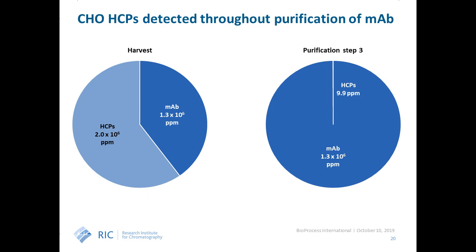And in both cases, the therapeutic is quantified at 1.3 milligram per milligram, where it theoretically should be 1 milligram, of course. And this gives you already a very nice idea on the accuracy of this semi-quantitation strategy, which is generally expected to be between 50 and 200%.